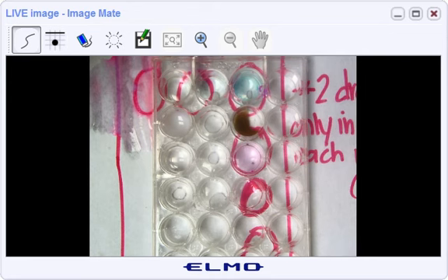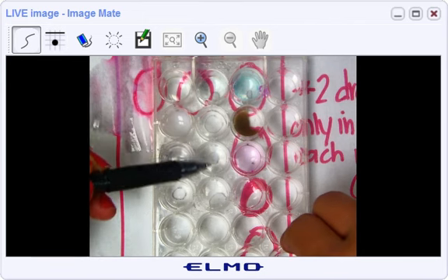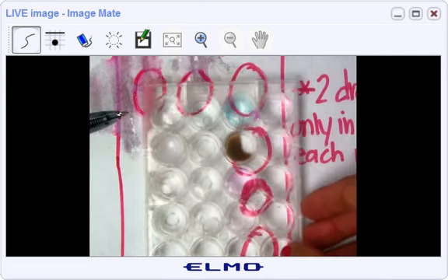Okay? Now then, write down your observations. Now then, the rest of it you can do. Those were just worded weird. I don't like the way they're worded. So in column 2, where Na2SO4 was in, there was no precipitate in any of them. Okay, so this is column 2.